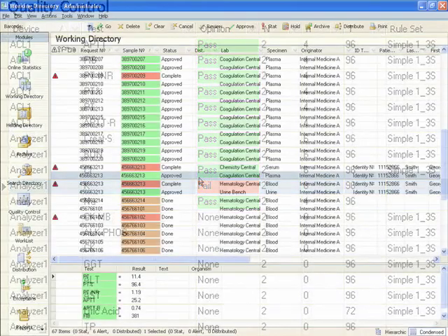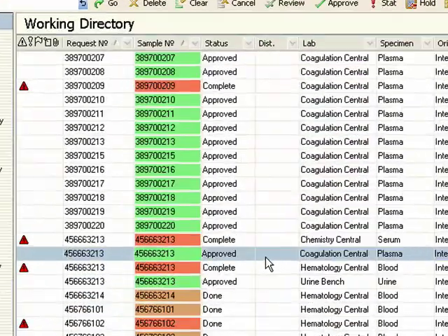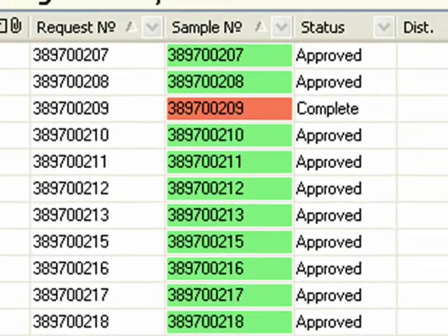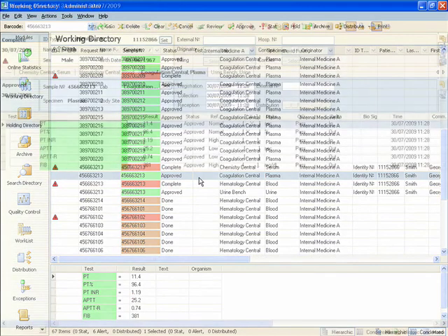The color-coded main form list gives an immediate, visually effective display of the status of tests and analyzers. Results are then clinically evaluated.